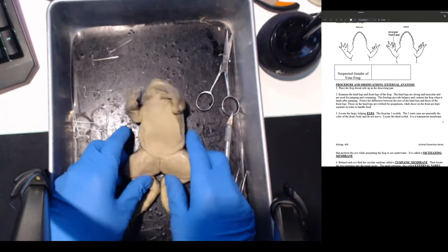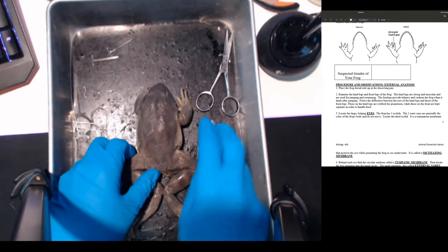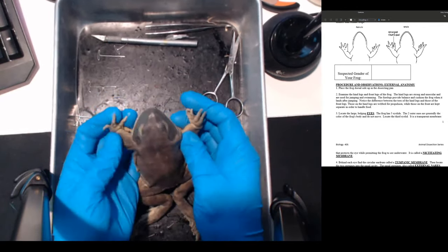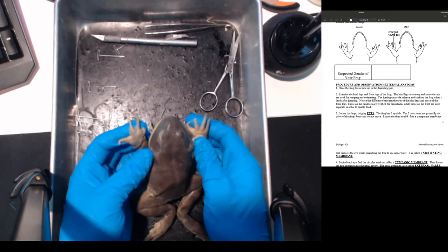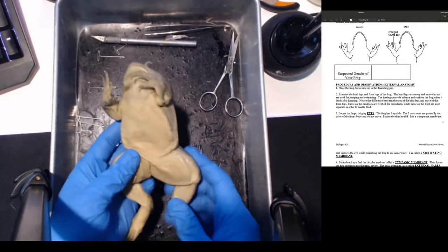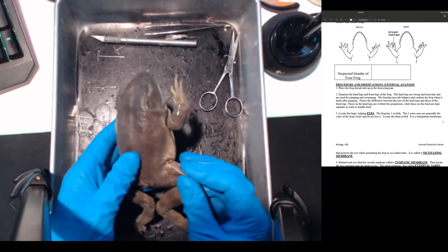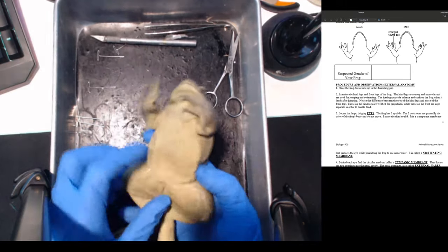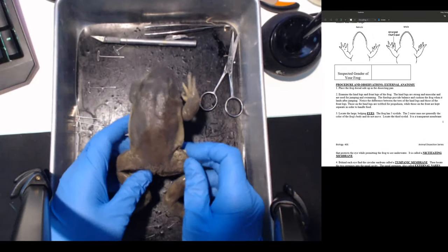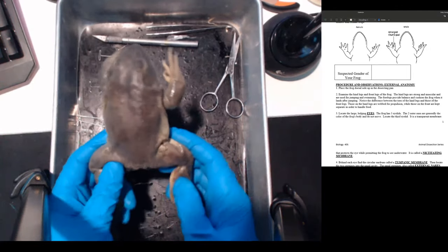We're going to put the frog here with the dorsal side up - so this is the back, that's your dorsal side. Frogs are amphibians, and you can see their skin texture is very different from a reptile. Frogs absorb moisture through their skin. They're amphibians because they have two lives - born in the water and they can also live on land.